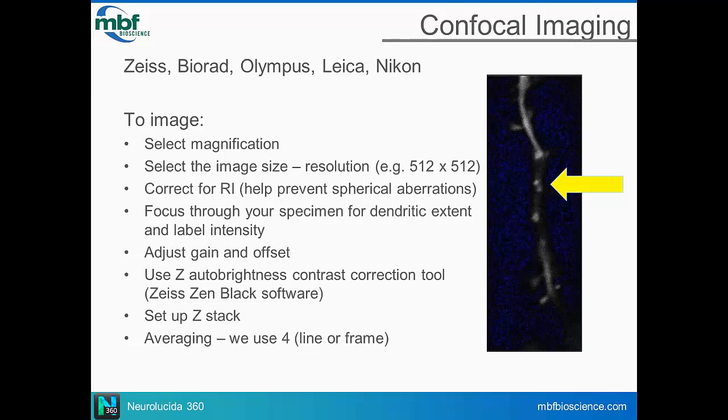That's okay, but for our purposes it's not, because we actually want to get a little bit of space above and below so that you're encompassing the entire neuron or the entire dendrite with space. Because if you happen to cut off the top of a spine or cut off some dendrites, you're going to lose that information, and that spine won't be good for quantification, or that neuron won't be good for quantification because you're missing data.